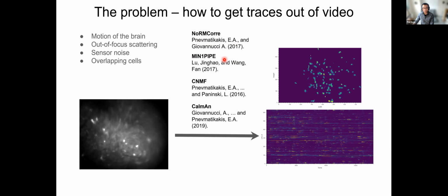And before I go into talking about how exactly we do this, I want to introduce a basic concept for image processing, just so that everyone is on the same page, and that is something called a kernel. So a kernel is a way we represent how we compute the pixel value for image processing. The way it works is that for each pixel in the picture, you put that in the center of this matrix here, and then all the numbers surrounding that tell you how much weight the surrounding pixel is going to contribute to the new value of the center pixel here.